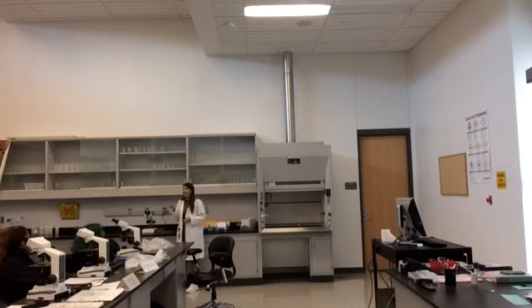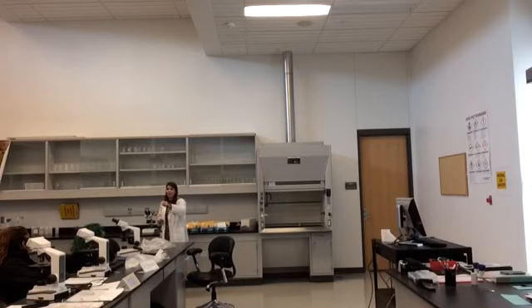So why is it called a dissecting microscope? Normally, we use this when we're dissecting specimens. Like, for example, if you're a medical examiner and you pull out some intestine and you notice some irregularities, in order to use one of these microscopes, I have to take that tissue and make it into a microscope slide. That takes time. But if I have a dissecting microscope, I can come over here, take that whole section of intestine that I wanted to look at, and I could put the whole thing underneath it and look through it, and it will give a closer look.